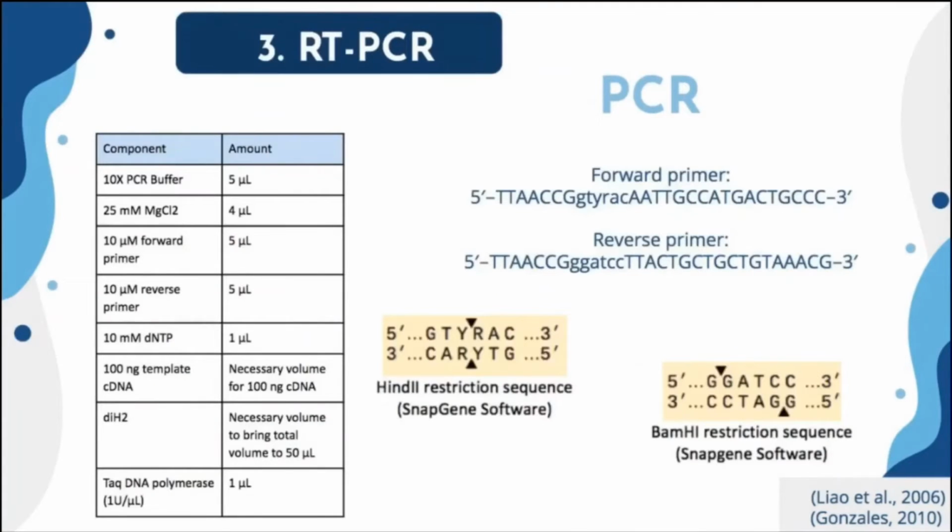Now, some specific primers are needed to copy only the gene of interest. These primers were designed to anneal to both sides of the GSH2 gene. A mix of the target DNA, dNTP, stable DNA polymerase, and the primers must be inserted into the thermocycler, and many cycles will be produced until enough DNA has been created.